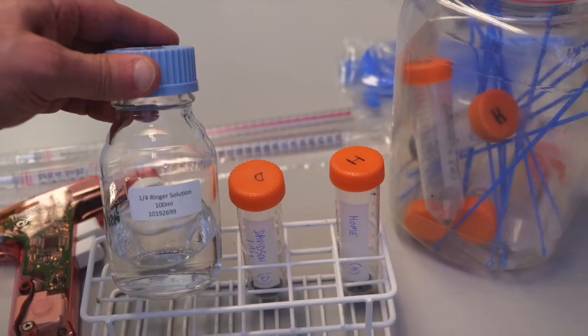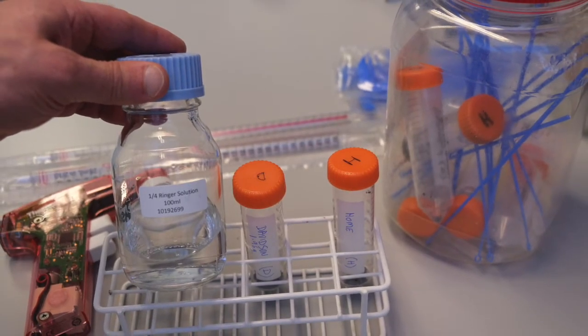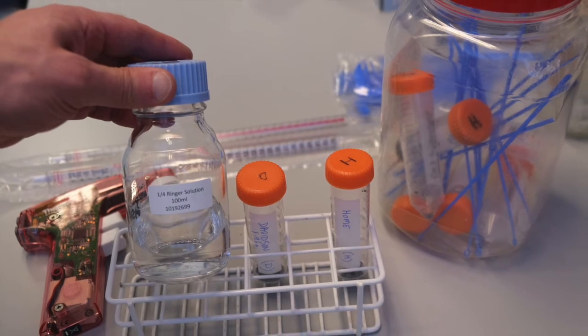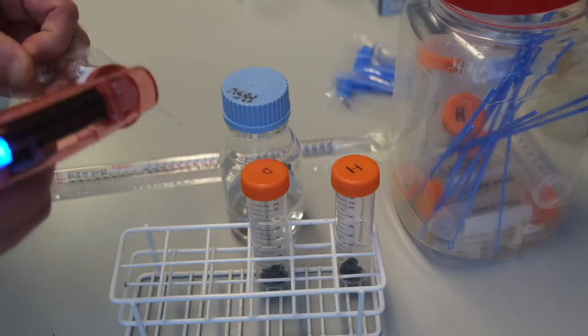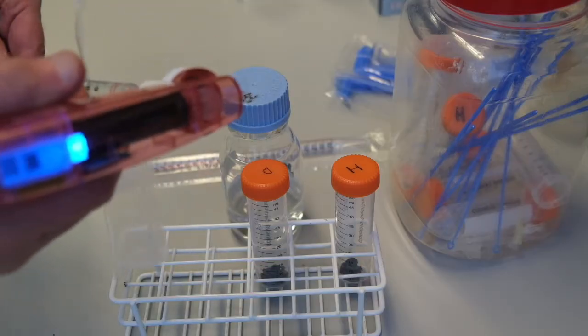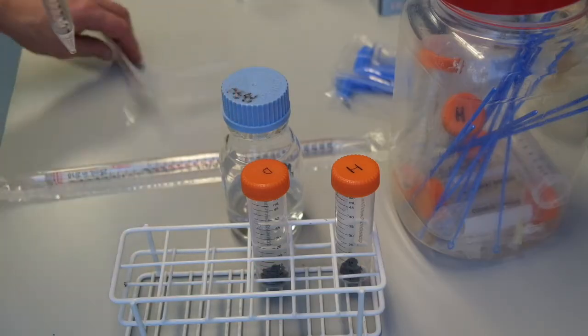We will re-suspend each soil sample in 25 milliliters of Ringer's solution. Then using this 25 milliliter pipette and an automatic pipetter we add the Ringer's solution to each soil sample.